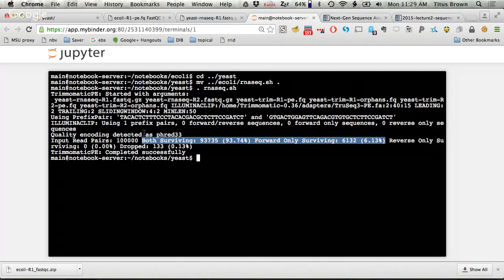Is there another theory? Actually, now I'm wondering. I was thinking if the reverses were short fragments, but if they were short fragments, then you'd expect both forward and reverse to be trimmed, if there was read-through. So yeah, I think it's just got to be that it's bad sequence quality. Okay, I was trying to be clever, but the answer is probably just that there were a bunch of really cruddy R2 sequences.